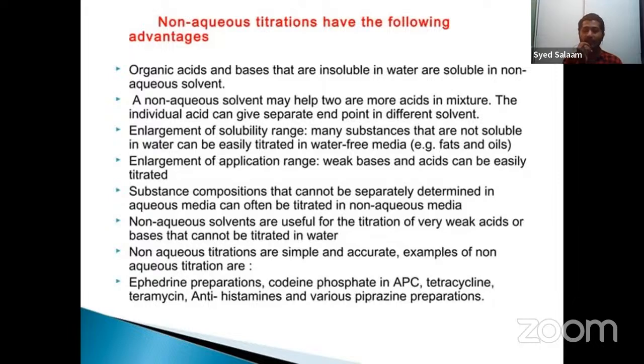Next, a non-aqueous solvent may help when a mixture of acids can be dissolved, and the individual acids can give separate endpoints in different solvents. And next, enlargement of the solubility range. We can take fats and oils, which are not soluble in water, and dissolve and titrate them by non-aqueous titrations.